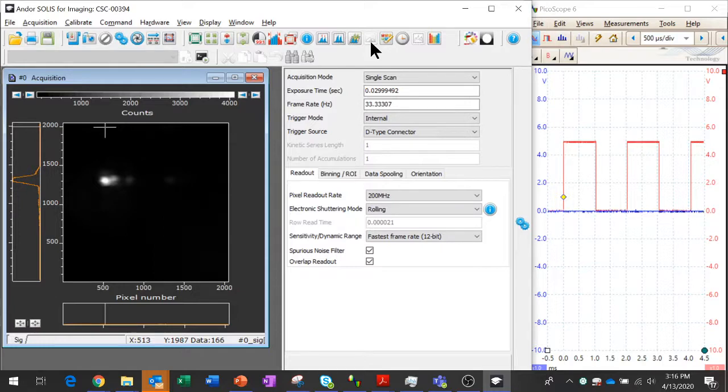And in this short demo, I'll show you how to capture high-speed spectra on a Marana 4BV11 sCMOS camera. On my screen, you can see an image of a multicolored LED source, imaged through a diffraction grating. I have the source cycling every millisecond between blue, green, and red emission, but because the exposure time here, about 30 milliseconds, is long relative to the emission of any one channel, it's all mixed together.